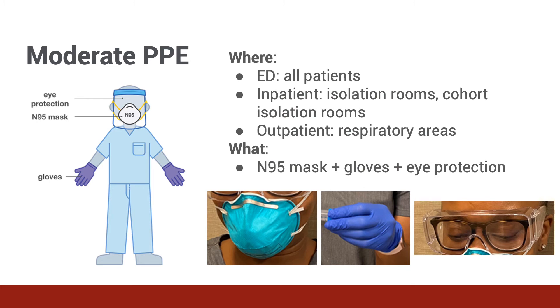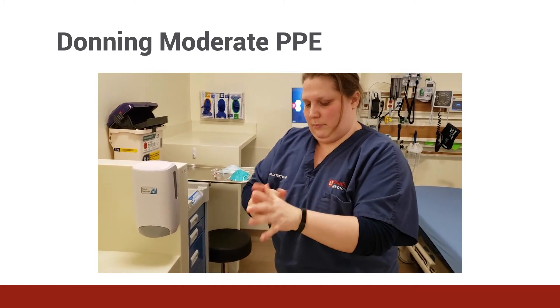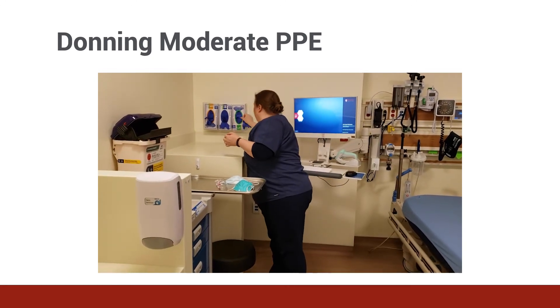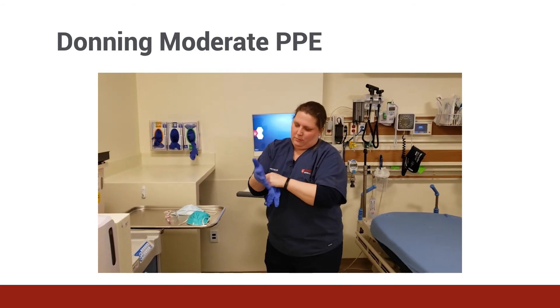We use moderate PPE in the emergency department for all patients, in any isolation room or cohort isolation room inpatient, or in any respiratory areas in the outpatient setting. This personal protective equipment includes an N95 and gloves. Ideally, eye protection should be used if there's any concern about droplets or a splash into the eyes from something like vomit. For proper donning, wash your hands for 20 seconds covering all appropriate surfaces. Then put on your gloves, followed by the N95 mask, which provides a substantially higher level of protection for droplets and airborne particles.